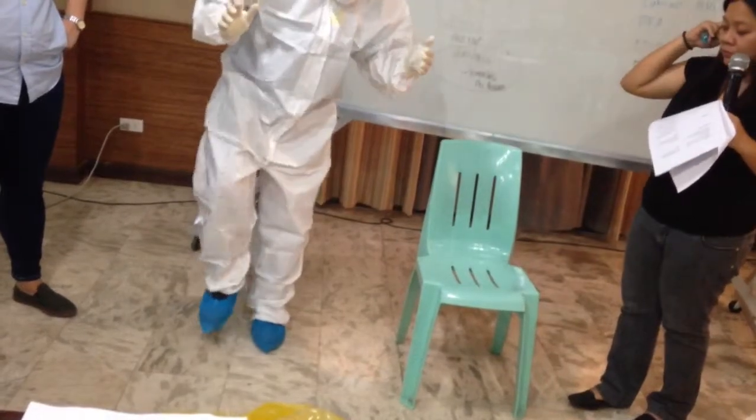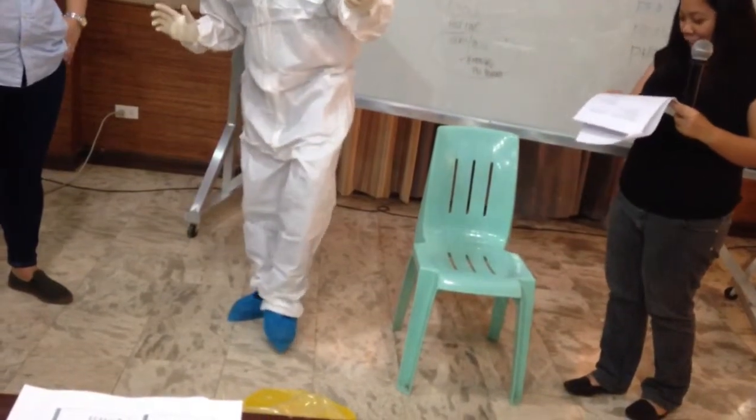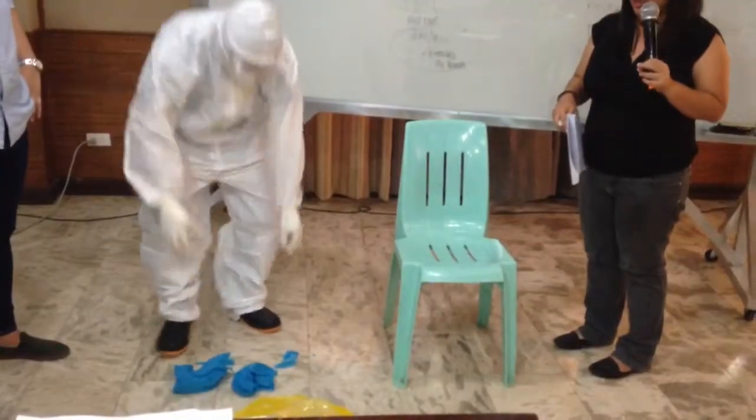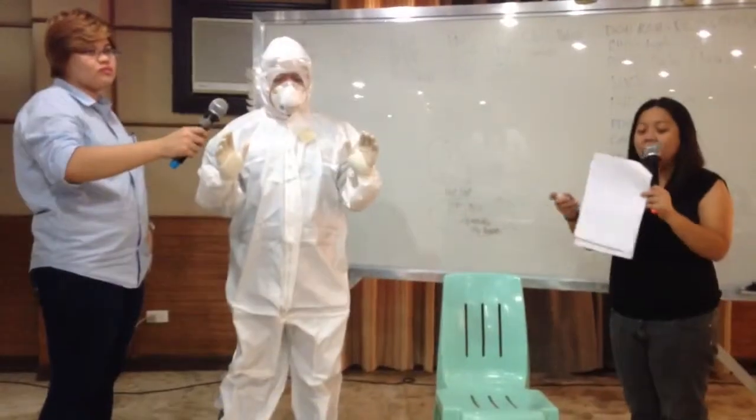In this step, Dr. Laxamana is trying to remove the boot covers without the aid of the trained monitor, because contaminants may lay in it. I'm going to get exposed. So, after removing boot covers, disinfect outer gloves again.